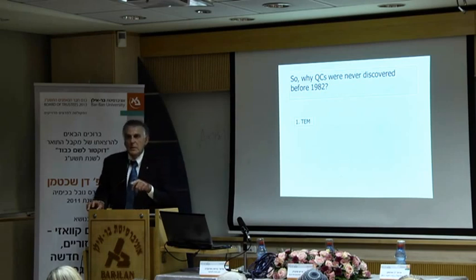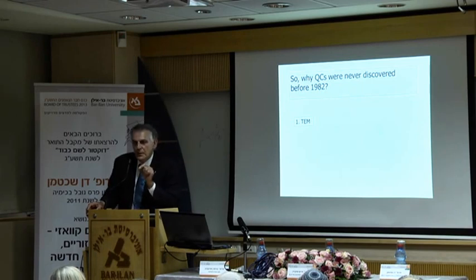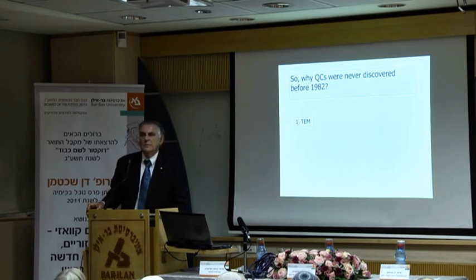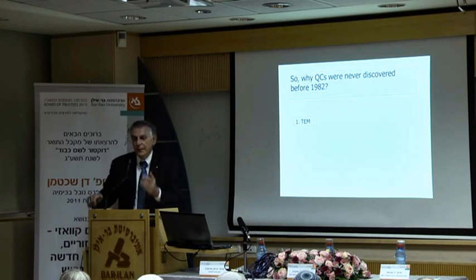You have electron microscopy in this university, I know the people in charge of that. We produce very few experts in electron microscopy. Of all these hundreds of thousands, very few become experts. They use the machine. It's a wonderful magnifying glass, but they don't become expert on the machine. And this is because the machine is expensive to use. You pay $100 or so for every hour you use it. And the professors are not very happy to do that if they are not experts in it, and there are many other reasons.